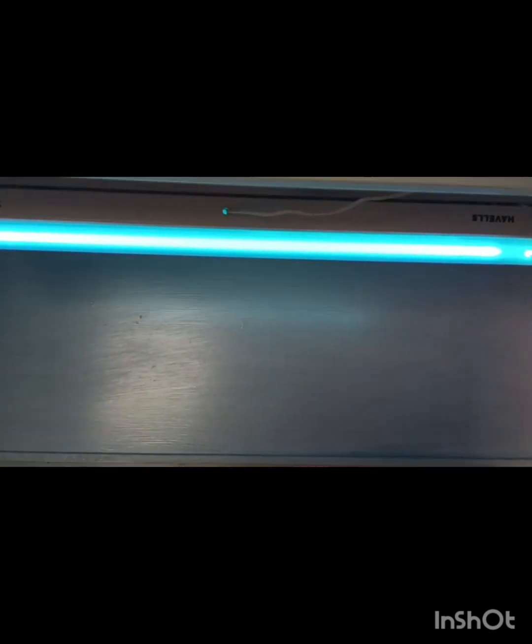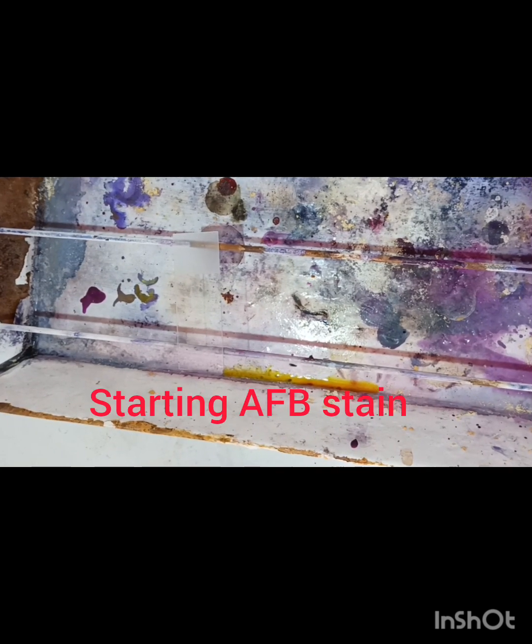After cleaning with 1% sodium hypo, we have to switch on the UV light in a laminar airflow, and we should remember that the total process should be completed within a closed laminar airflow. Now we will start the staining procedure.